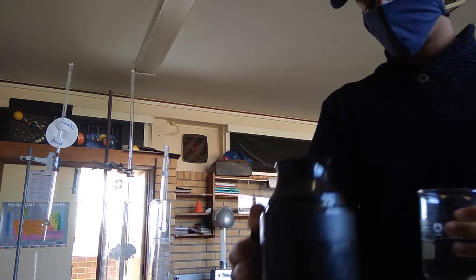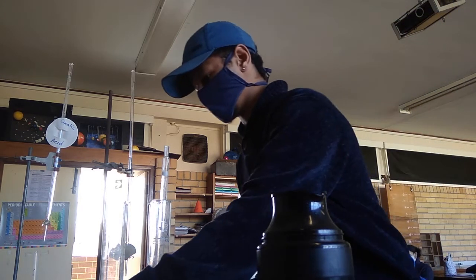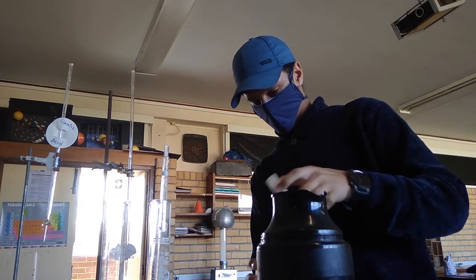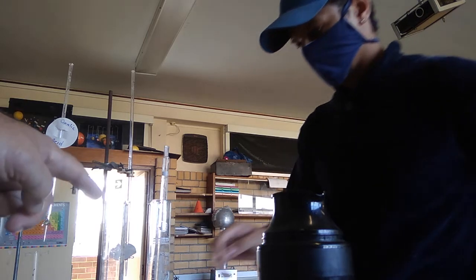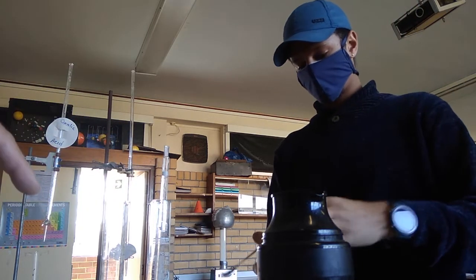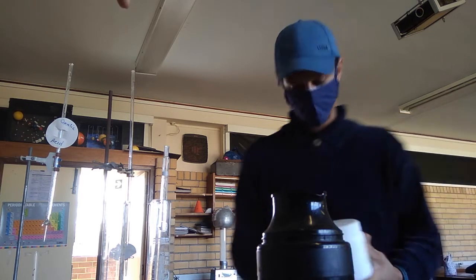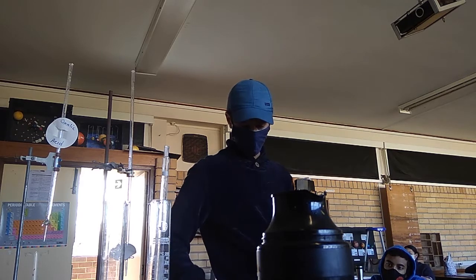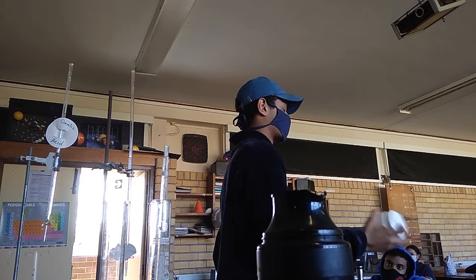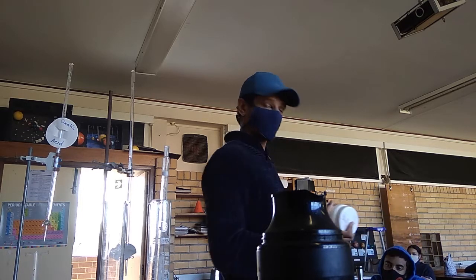One of those is sodium hydroxide. Won't you just open the lid of that? Grab a spatula. Okay. Just close that again. You see, here it is, and just turn the glass and shake that sodium hydroxide. Can you hear it rattling? That shows that it's newish sodium hydroxide.